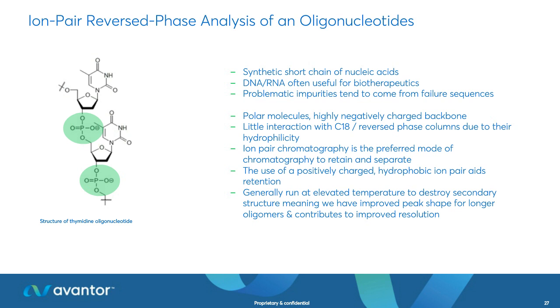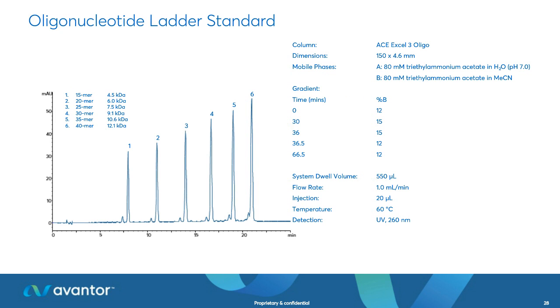There's lots of different ion pair reagents that you can use. You need a hydrophobic, positively charged ion pair reagent, because then that allows the highly negatively charged oligo to interact with that hydrophobic stationary phase. So we can then easily separate the target oligonucleotides from their chemically modified byproducts based on hydrophobicity. So we can use ion pair, this variant of reverse phase, to get N+1, N-1 separations.